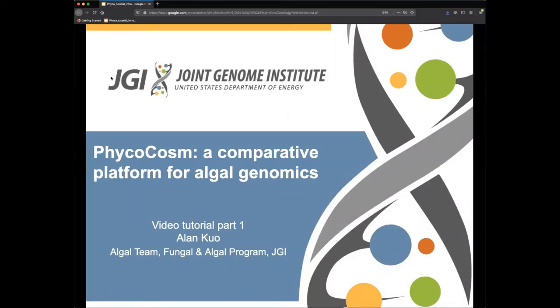My name is Alan Kuo, and I am a data scientist on the fungal and algal genomics team at the Joint Genome Institute, or JGI. In this series of video tutorials, our algal team will discuss the various omics data and analysis tools available on our algal web platform, PhycoCosm. In this first part of this three-part series, I will present an overview of our various tools for navigating to the data available in PhycoCosm.